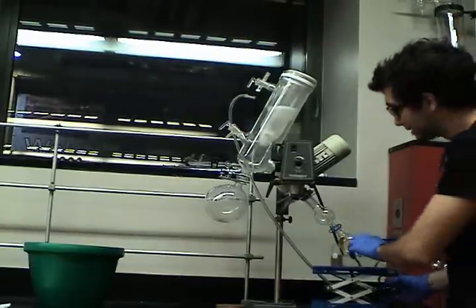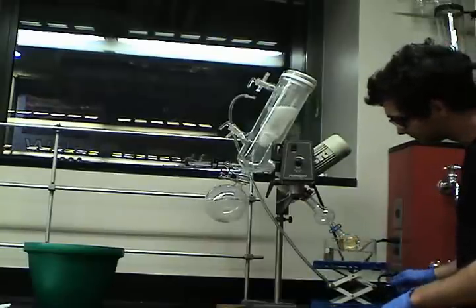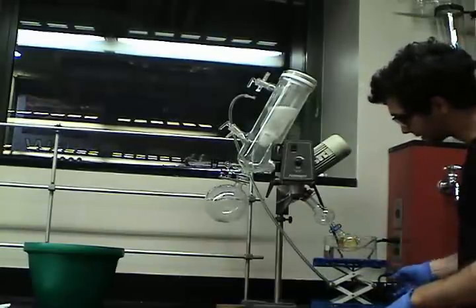And raise the water bath to touch the flask.